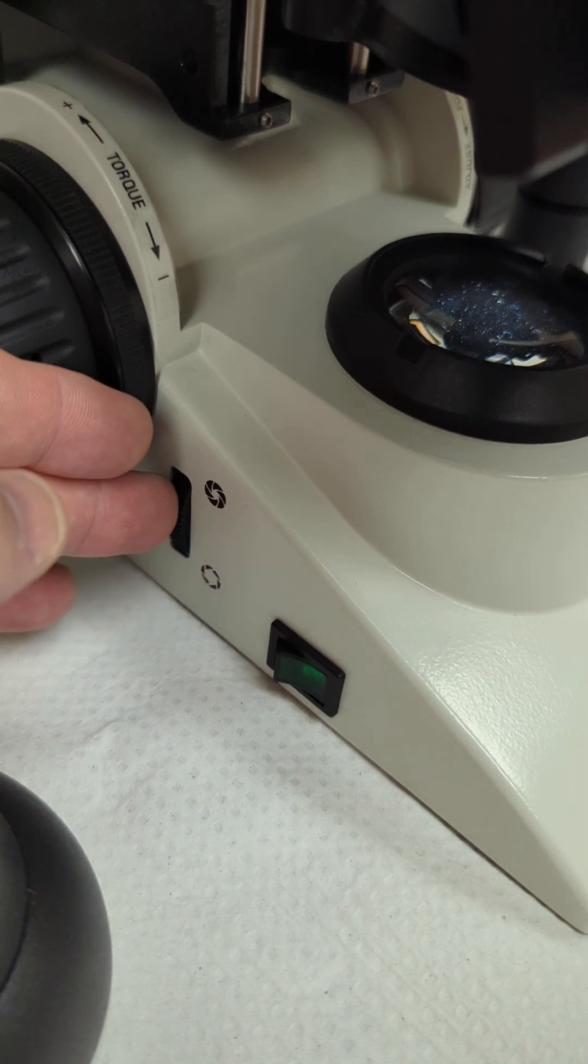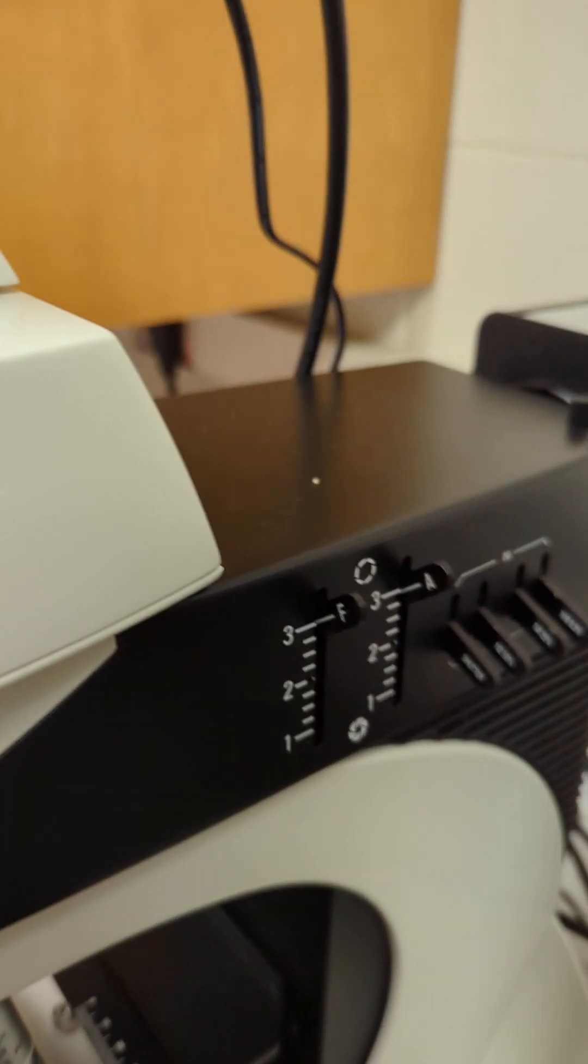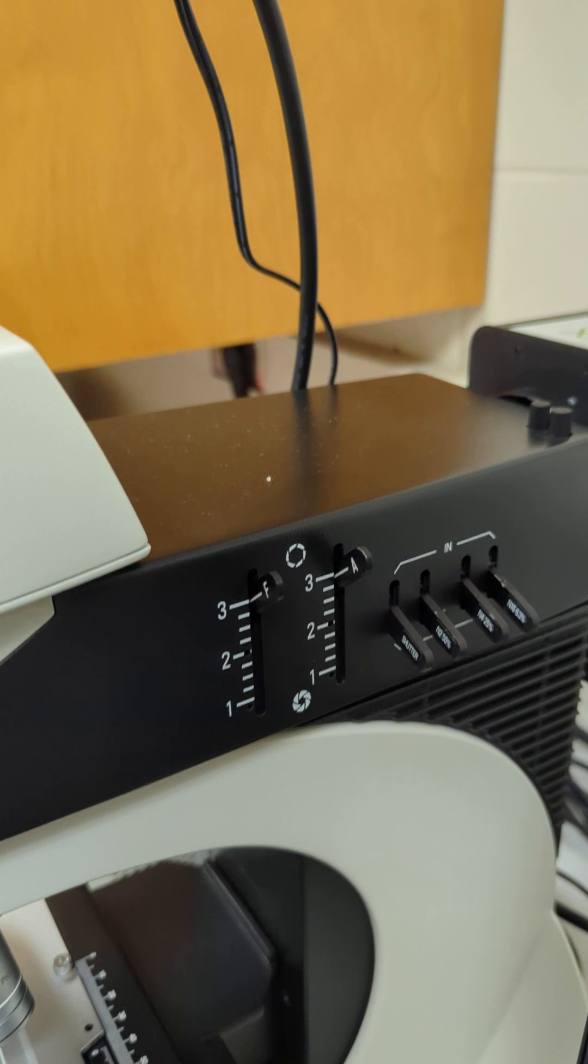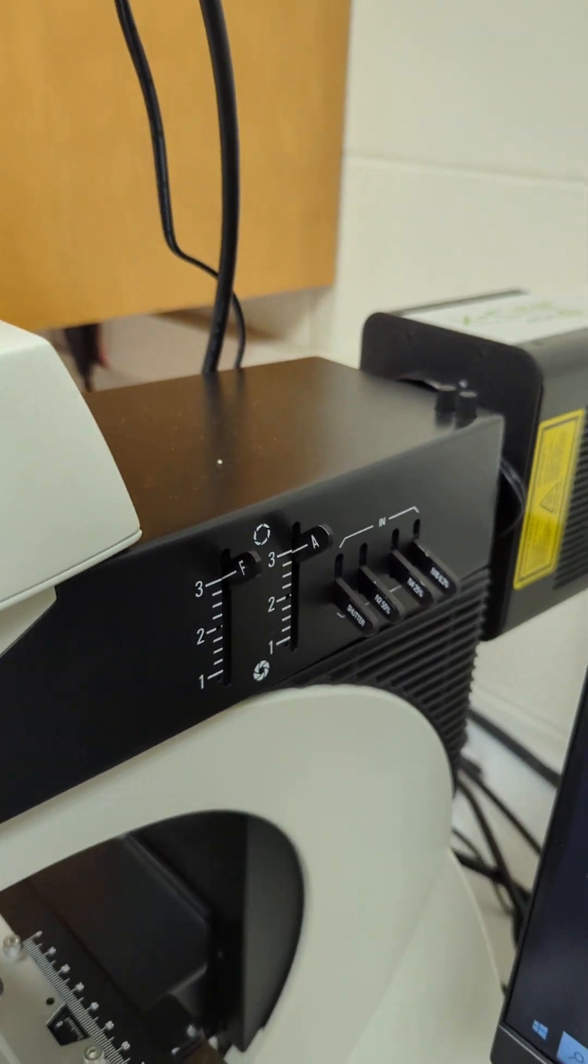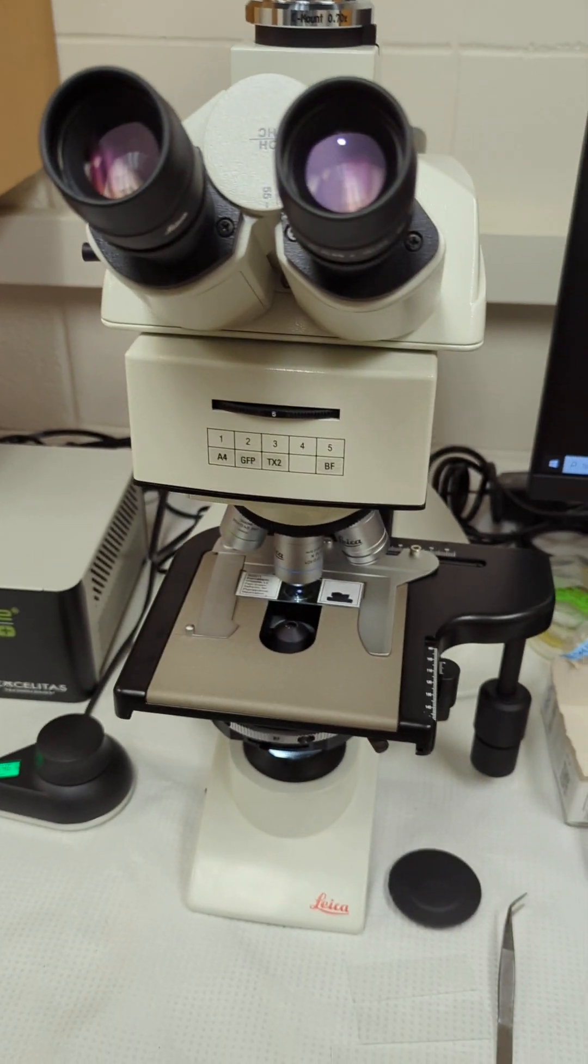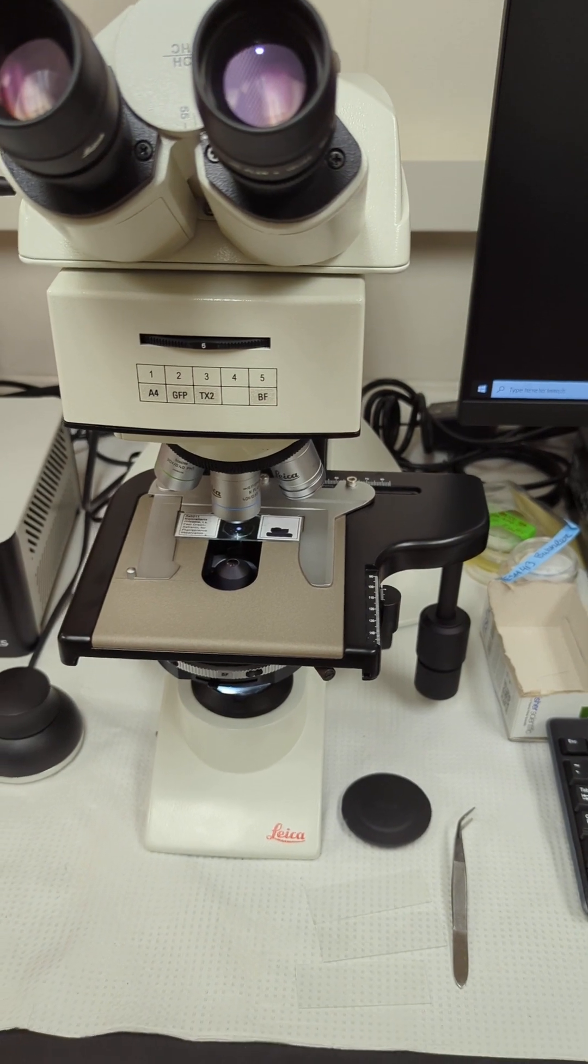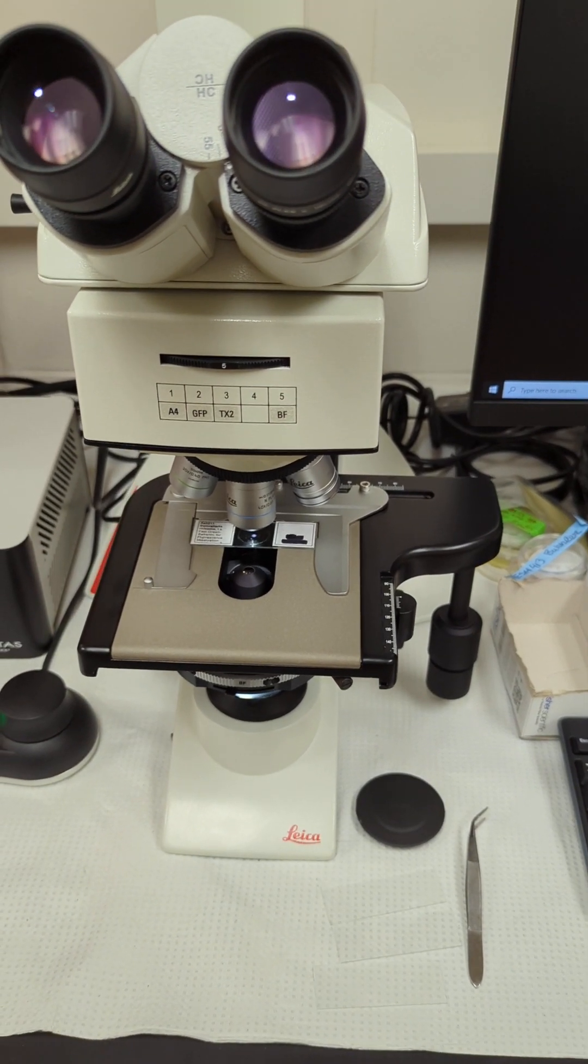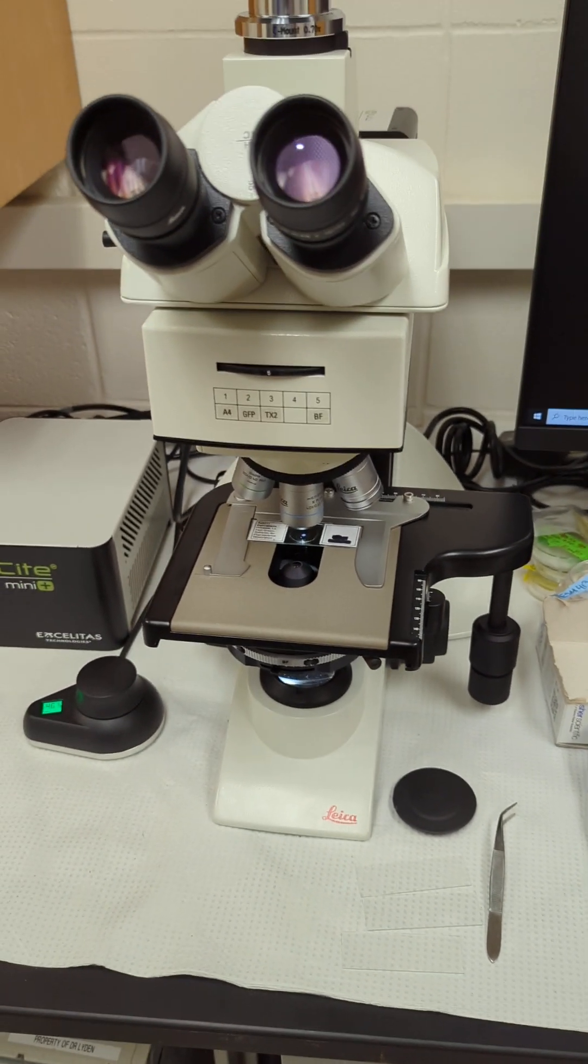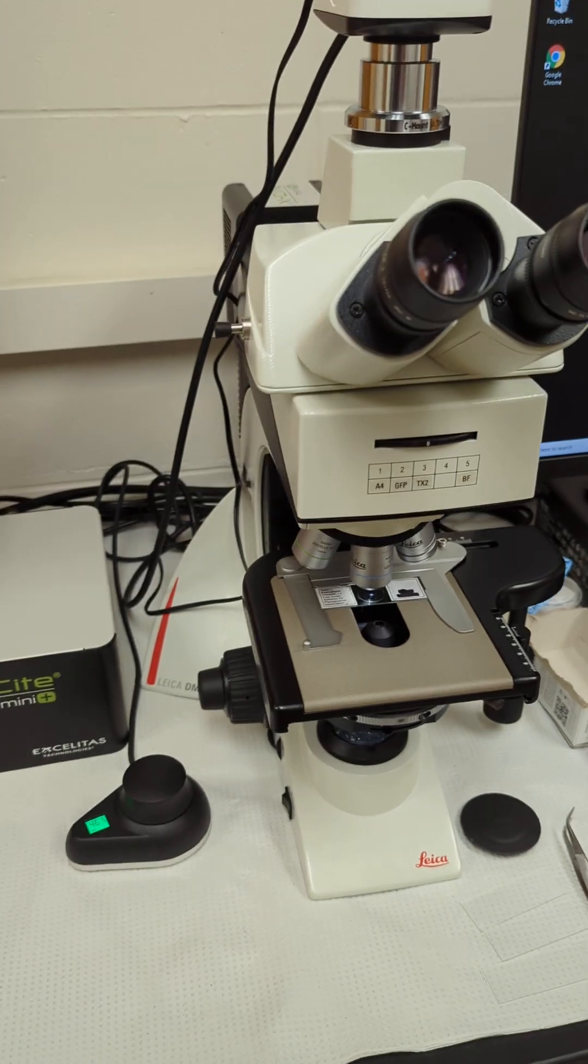That's an overall review of the actual microscope parts, and I'll get into more details in other videos of each of those things.